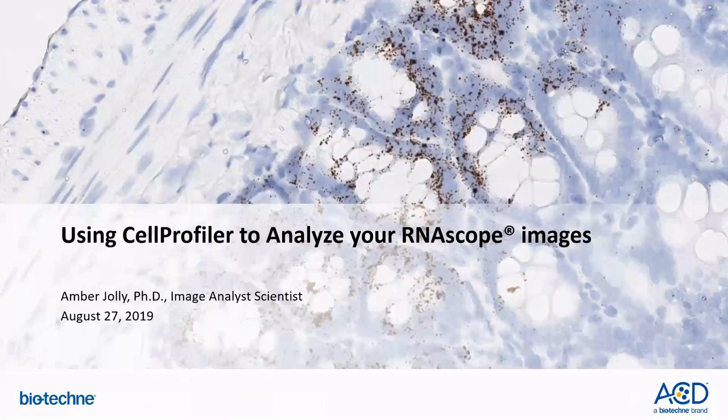Today, we will review the steps required to perform image analysis of ACD's RNAscope and Basescope assay images using the open source image analysis platform CellProfiler. The CellProfiler image analysis project was started in 2003 by Anne Carpenter, Thouis Jones, and the Golland Laboratory. The CellProfiler team is based out of the Carpenter Lab at the Broad Institute of Harvard and MIT.